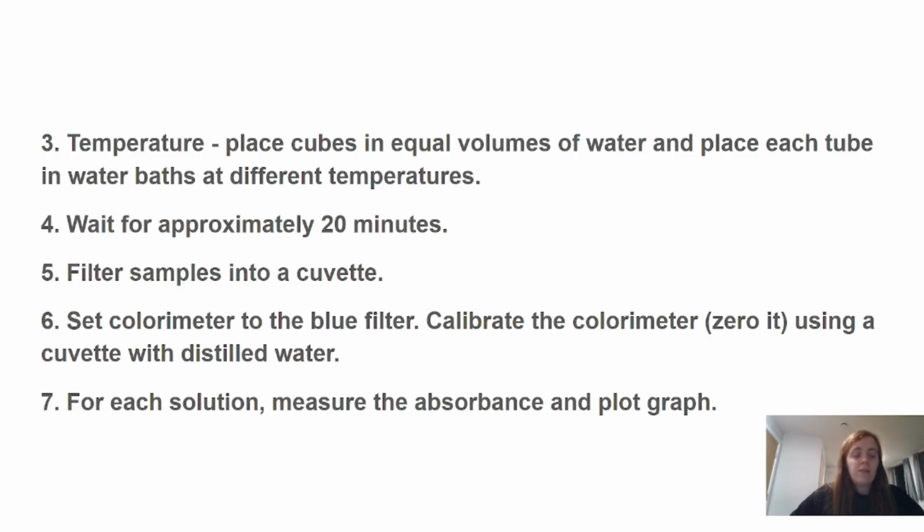And then for each solution, if you're doing your temperature, it will be the 10, 20, 30, 40, 50 degrees one. And if you're doing the ethanol concentration, it would be the 0%, 50%, 25% one. For each of these, you need to measure the absorbance and then plot the graph against either the concentration or the temperature.